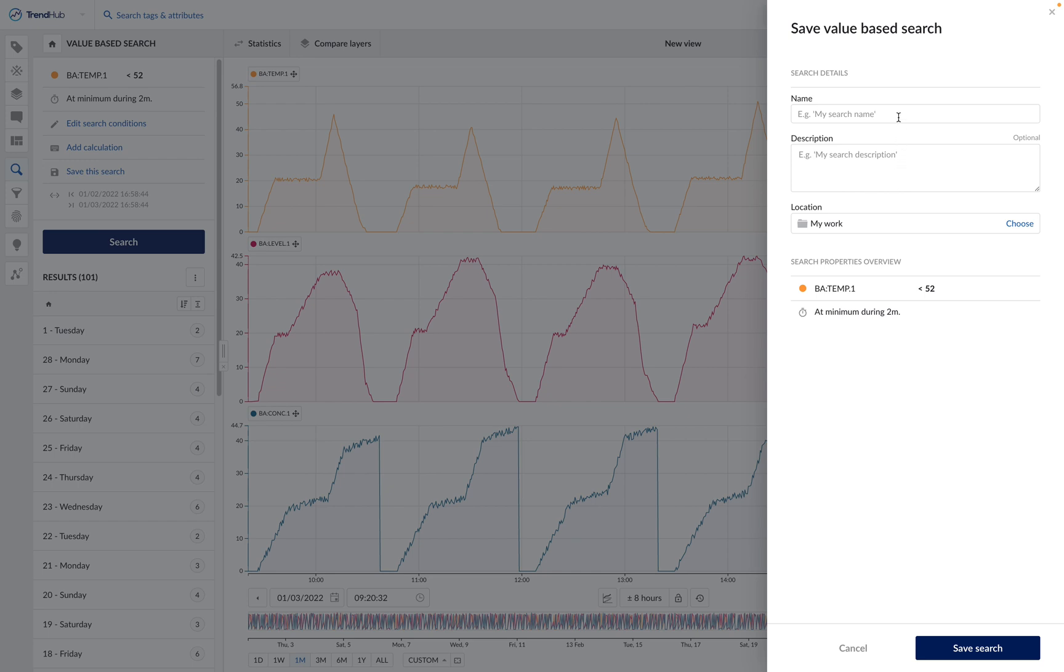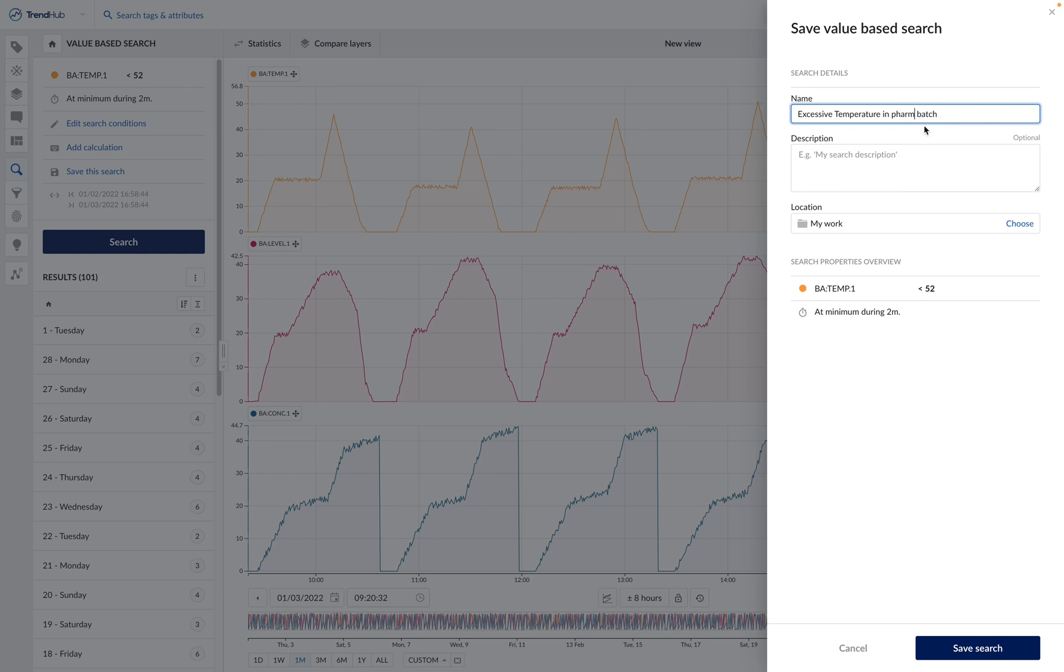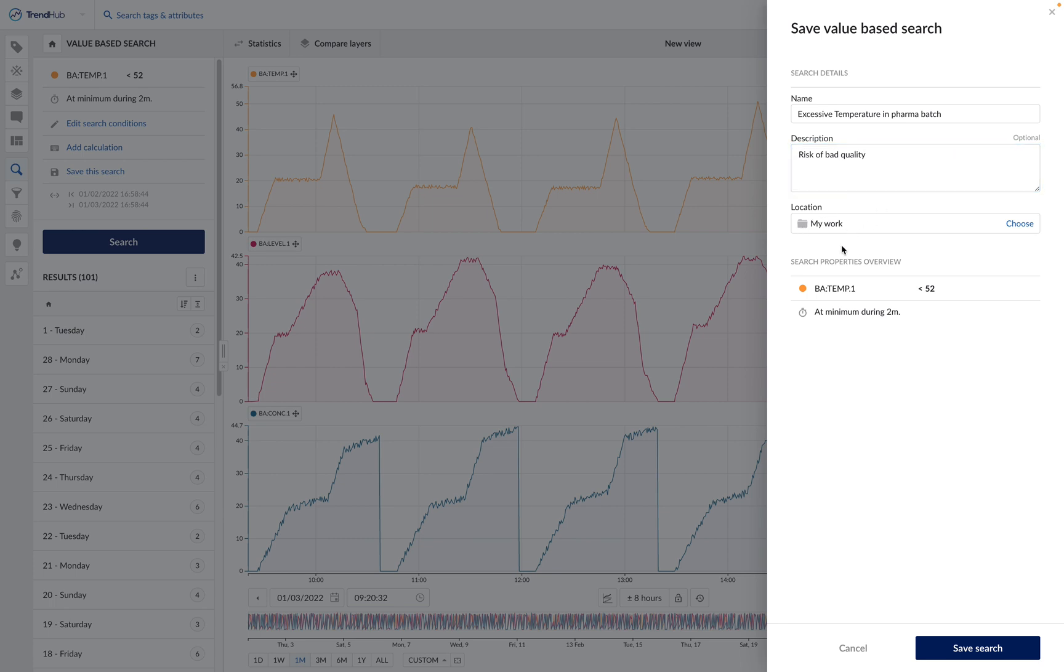Then we can give a name to this search, for example, excessive temperature in the pharma batch. We can give a description, for example, risk of bad quality. We can choose where to save this search in the work organizer, and we can click on save.